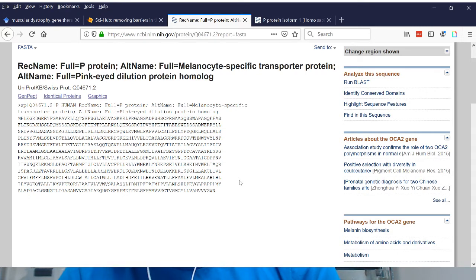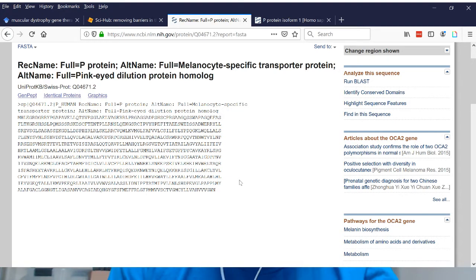Doesn't have a stop codon on the end, but we can always add that in. Always remember the stop codon. Whenever I'm putting new genes in plasmids, you always forget stupid stuff like the stop codon. So always have stop. It never hurts to have an extra stop codon.